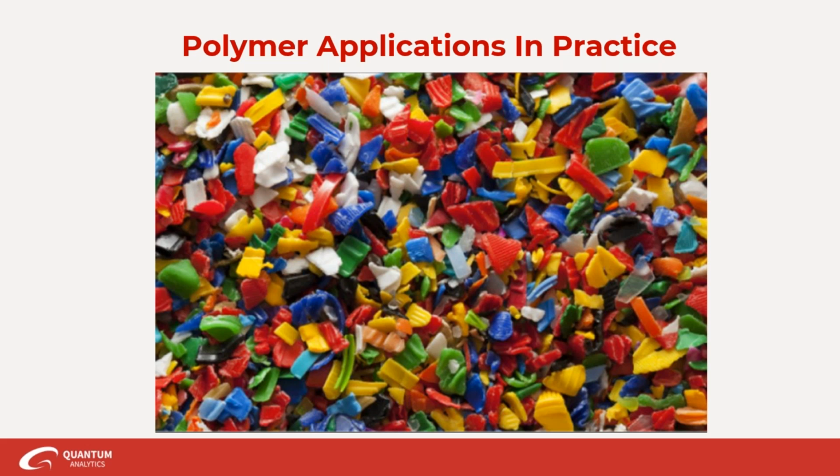And that's kind of progressing. They're using it to identify biodegradable plastics to be able to pull those out, and they're even using it for identifying marine waste. So this junk that comes up on beaches and in the ocean, they're pulling out. They're actually doing some studies to be able to identify the stuff that they find using near-infrared spectroscopy. And then of course the monitoring of the reaction, and of course you can use it for a final quality check to make sure your product is what you want.